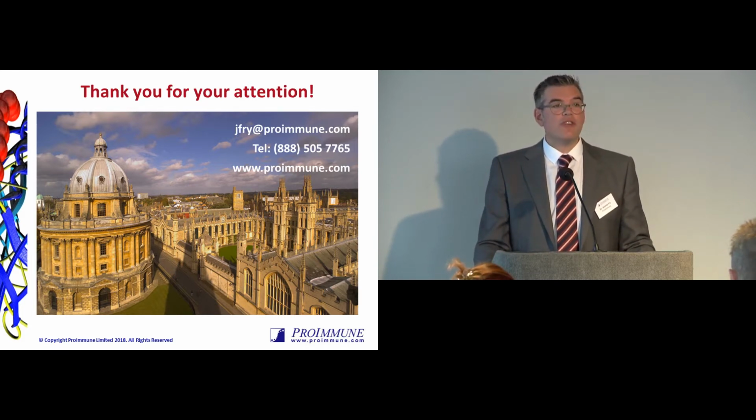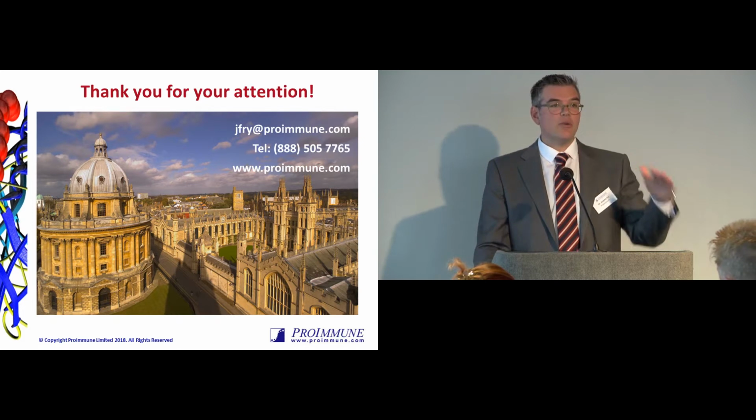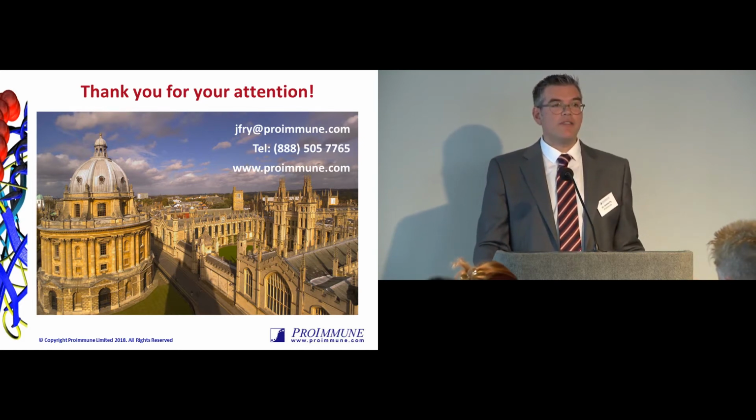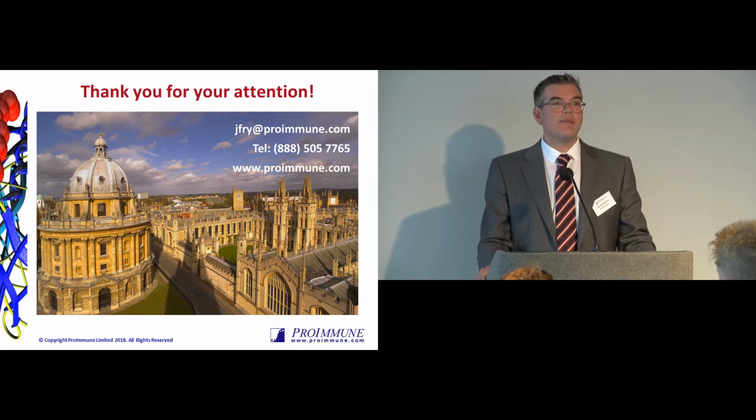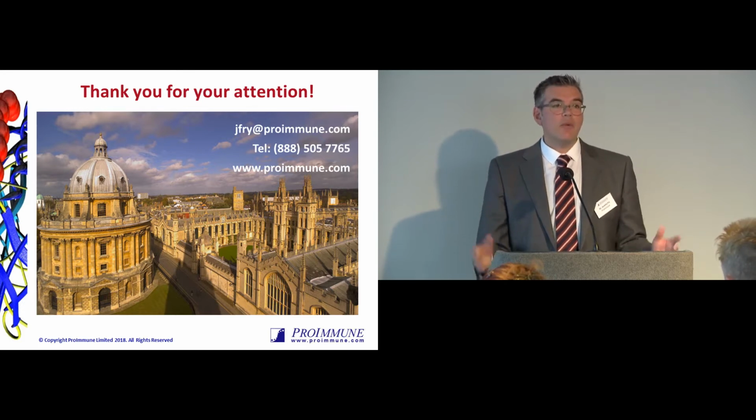If you do reduce the concentration of the protein in the assays, then of course the number of peptides that you will identify drops off. But that concentration is one that has been optimized. In the MAPS assay as well? Yeah. So if you go down in concentration, you see fewer peptides? You will see fewer peptides, yeah. Obviously that will depend a little bit on the protein, but yes, you will.